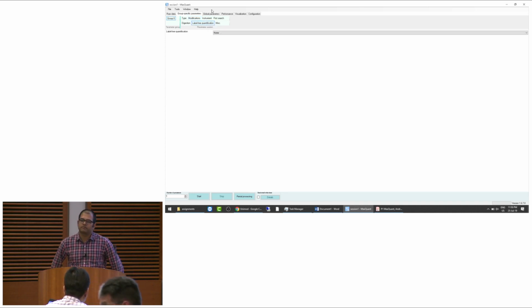So, in case of TMT experiments, what happens to N-terminal acetylation? Is it identified? That's protein N-terminal acetylation, right? So the initial protein N-termini would still be searched as acetylation, yeah, as a variable acetylation modification.